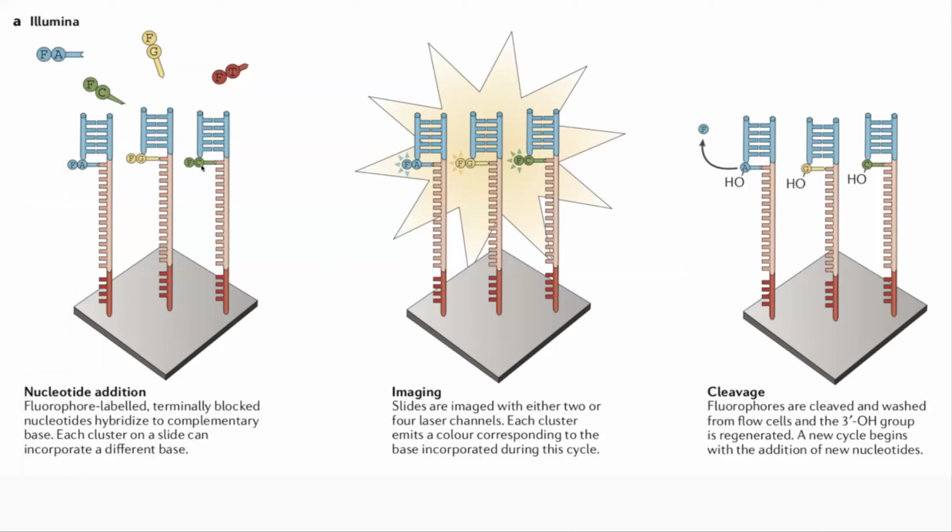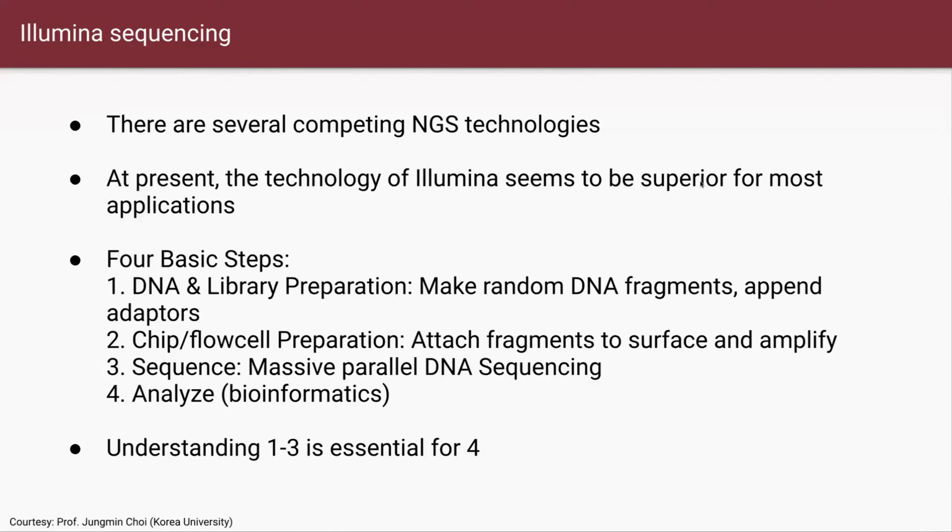And each nucleotide is synthesized with a fluorescent label. Then once it is incorporated, the fluorescence emits light. Then this emitted light is captured by imaging with the camera in the machine. Then you get to know the nucleotide information. Then once you complete that, you cleave off this fluorescence, then you go through another round of synthesis afterwards. We'll get to that point after this.